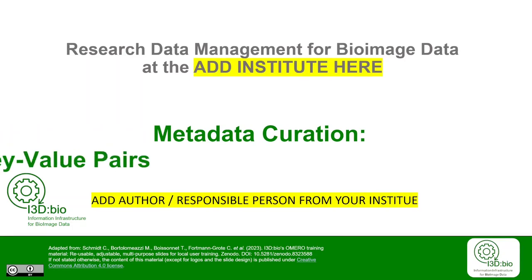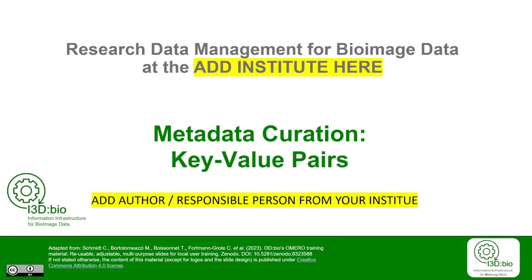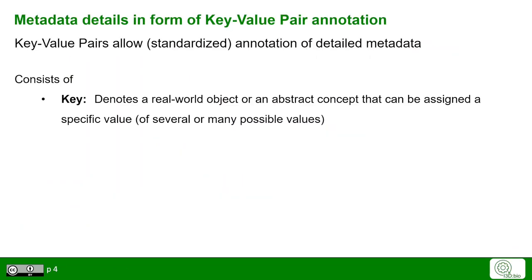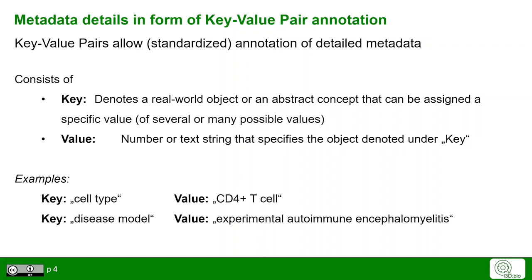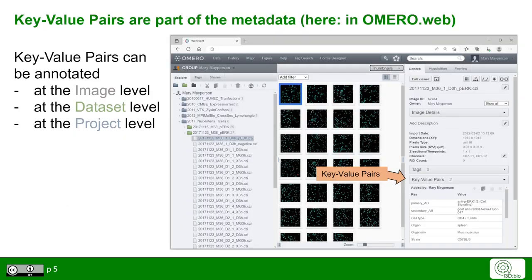In this subchapter on metadata curation, we now focus on the practical aspects of key-value pair annotation in OMERO. Key-value pairs consist of a key denoting some object or abstract concept and the value, which is the specific value for that key — for example, cell type with value CD4 positive T cell. Key-value pairs, like tags, are part of the metadata in OMERO found under the General tab, and can be applied at all levels: images, datasets, and projects.